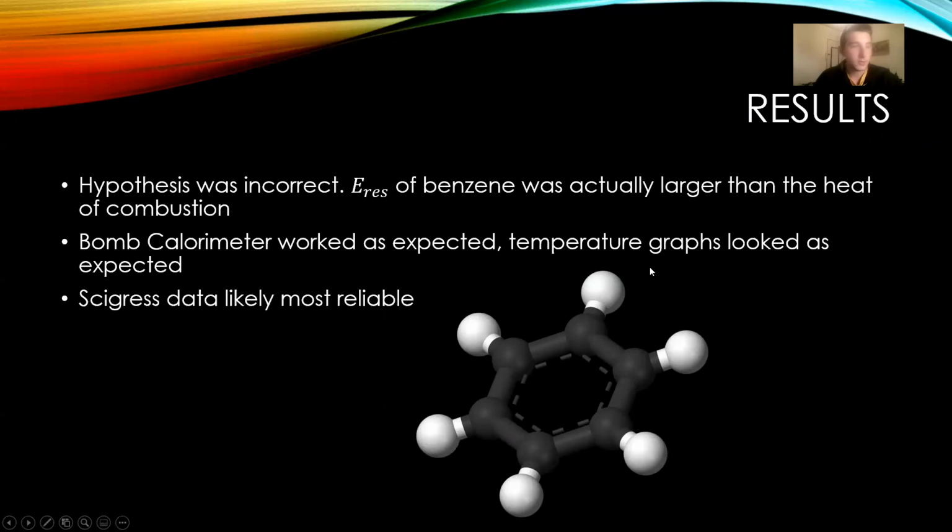Okay, so in terms of data here, the hypothesis was proven incorrect, which happens, and the resonance energy of benzene was larger than the heat of combustion. And benzene may be fairly unique in this property, and I'll discuss that a little bit later. But other than that, the experiment functioned as expected, based on the graphs generated.